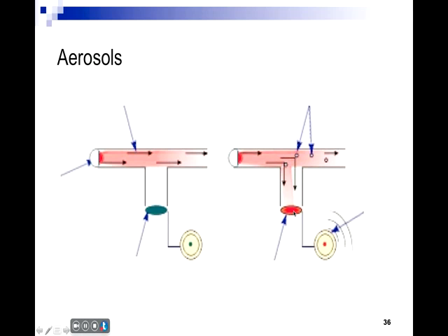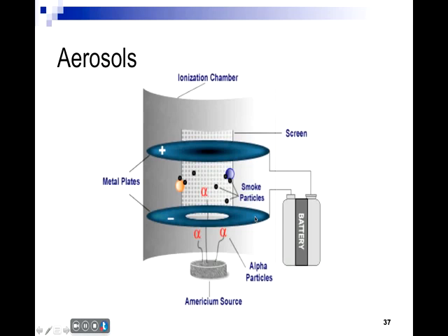So with light scattering, you can measure the amount of aerosols that are being scattered in any kind of medium. And the dustier it is, the more light that will be scattered. And so you can relate the amount of light transmission to the aerosol content of the air. So it's a real simple principle, and it's based upon the fact that particulate matter is going to scatter light.